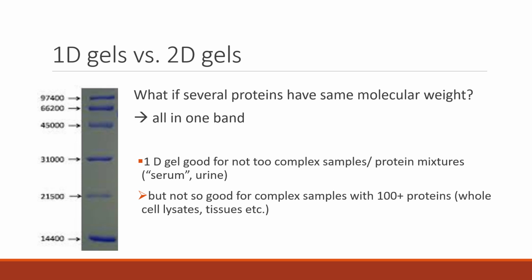The way that we do that is using a two-dimensional gel. In the next slide, I'm going to show you the actual process of that, and then I'll catch back up with you and discuss it quickly.